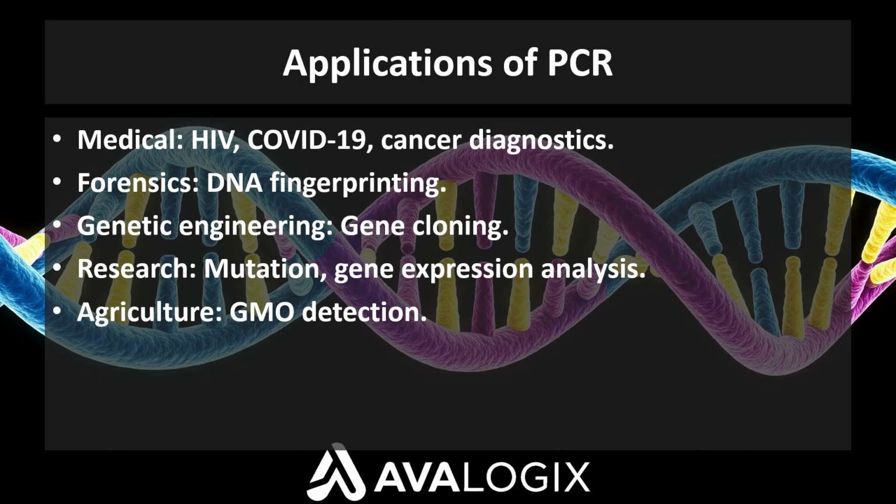Research. Whether it's checking for gene expression, creating genetic knockouts, or mapping genomes, PCR is at the center of modern molecular research. Real-time PCR is used extensively in gene expression studies with quantification of mRNA levels after reverse transcription.